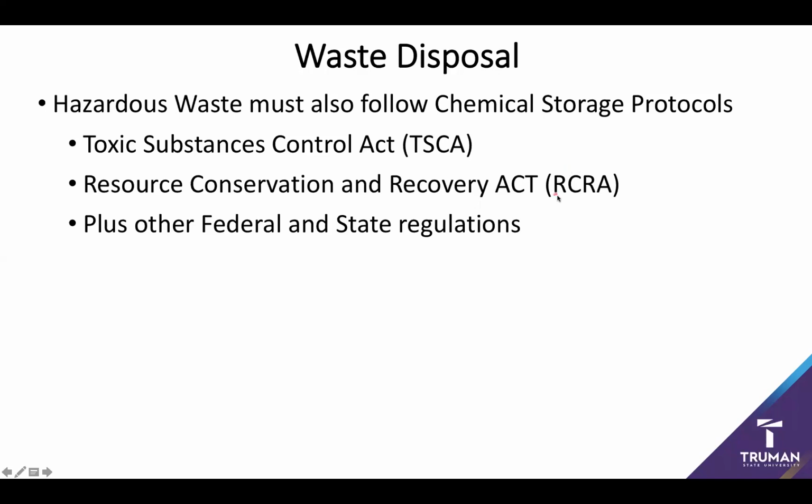And again, one of the things you also have to watch out for is there may be a lot of other very specific federal and state regulations. State regulations can vary from state to state and even from county to county. So make sure you're aware of what any local regulations are for the use and storage of chemical waste. As well as there's many federal regulations which are oriented towards certain types of waste, whether it's something like biological samples or, Lord help you, if you start working with things like radioactives or heavy metals. So again, make sure that when you're using waste that you're aware of what special regulations there may be for that type of waste.